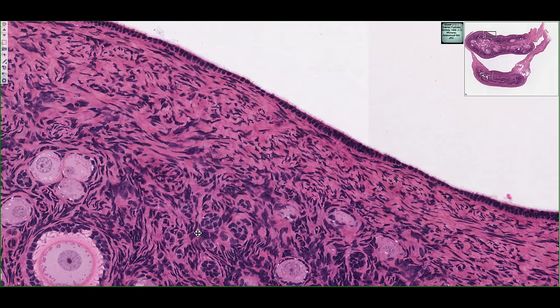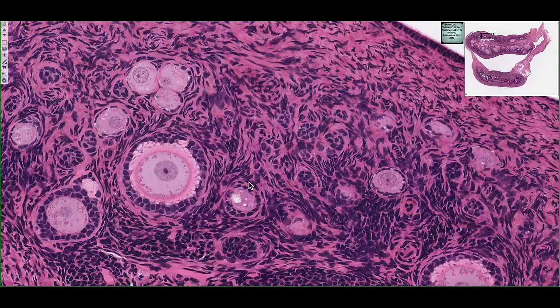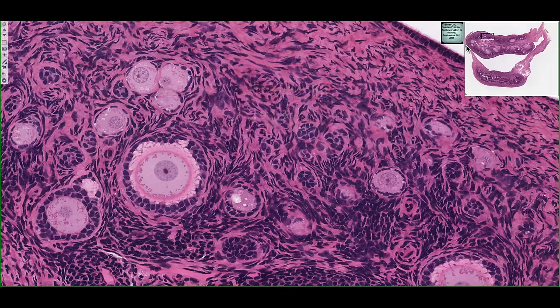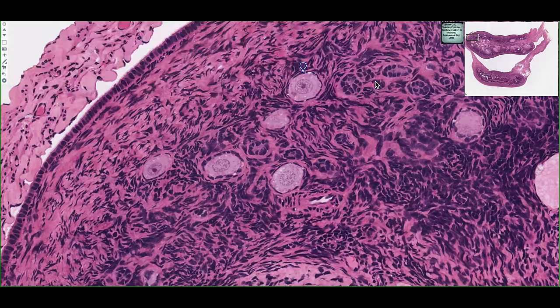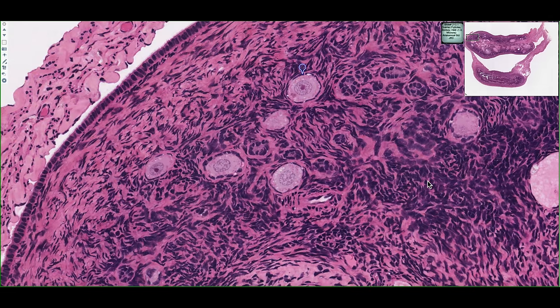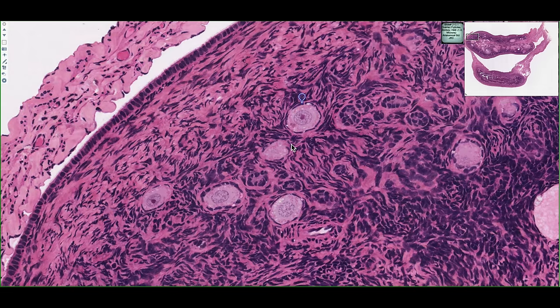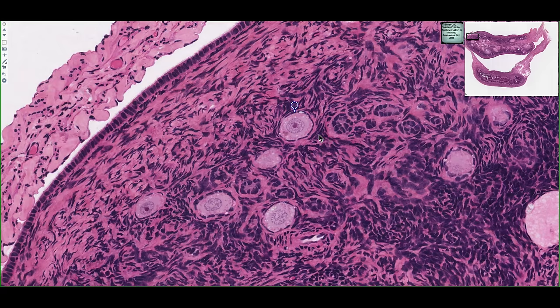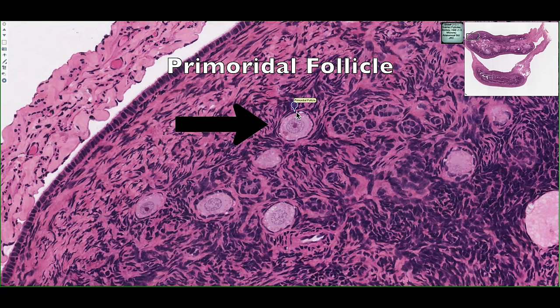If we go further deeper into the cortex, we'll see all these wavy cells that are found amongst the ovarian follicles. These are called stromal cells, and they essentially provide substance and support for the ovarian follicles. If we look at specific stages of follicular development, we can see this cell in the center of the field — this is called a primordial follicle.